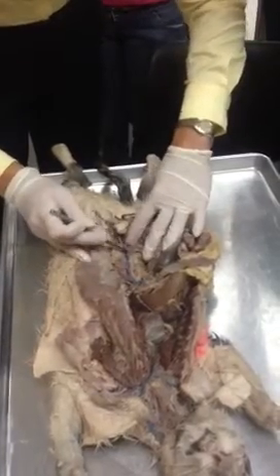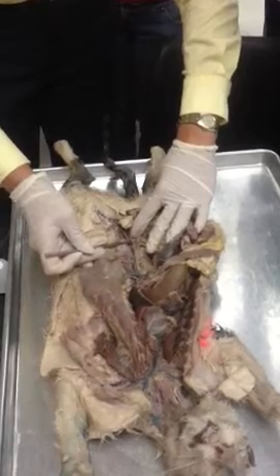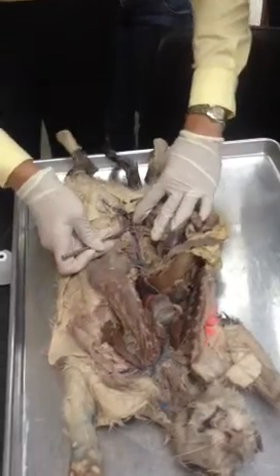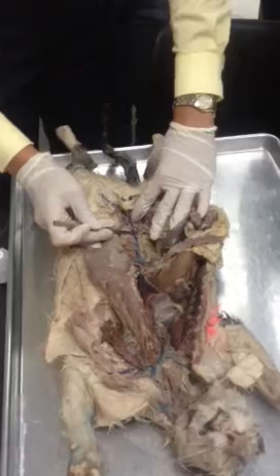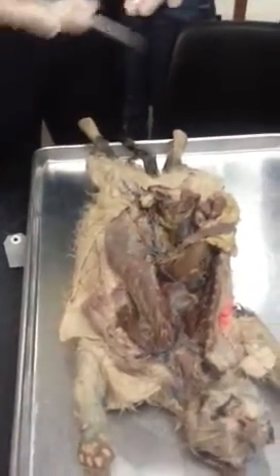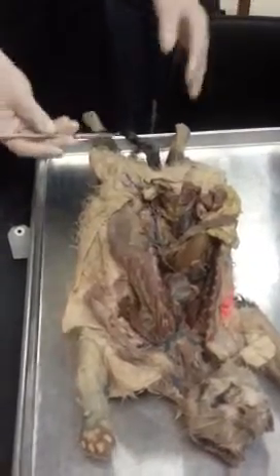And now the aorta branches into, and there's another difference with the humans, into the external iliac, and here little lower internal iliac. Where in humans we would have that abdominal aorta branches into the common iliacs, and then common iliacs branch into the external, what continues as a femoral, right? And internal, what supplies the organs of pelvic cavity and external reproductive organs.